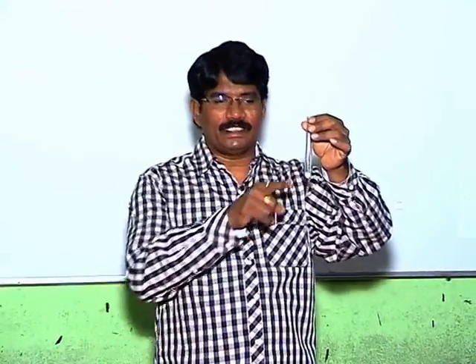So first let us do the action of concentrated sulfuric acid. With this, chloride, bromide and nitrate will be identified. Now I have taken the given salt into the test tube, a chloride salt. Now I am adding concentrated sulfuric acid.